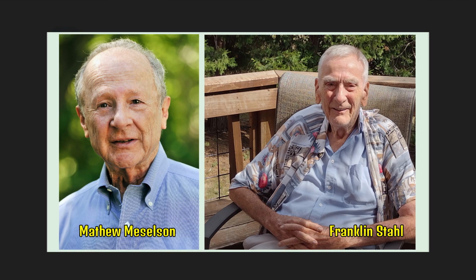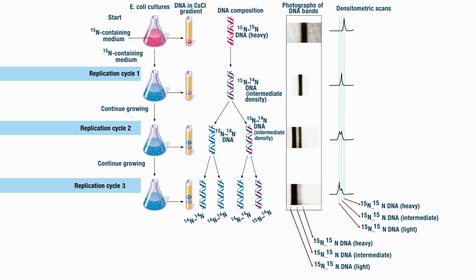Developed in the mid-20th century, density gradient centrifugation gained prominence through experiments like the Meselson-Stahl study of 1958, which confirmed semi-conservative DNA replication using cesium chloride gradients. Its ability to achieve high-resolution separations makes it indispensable in research from virology to proteomics.